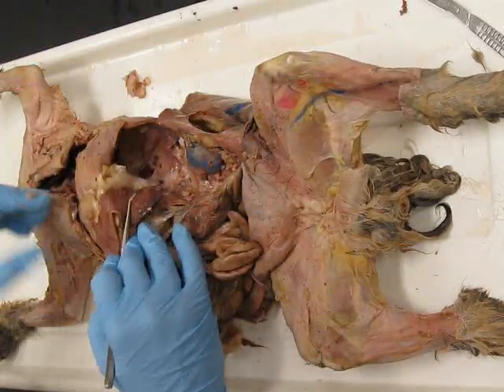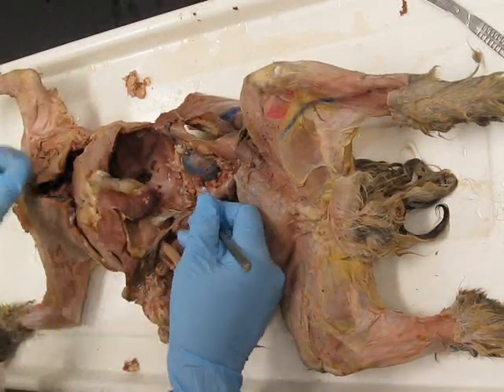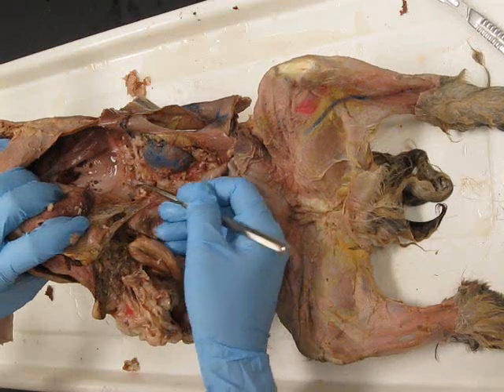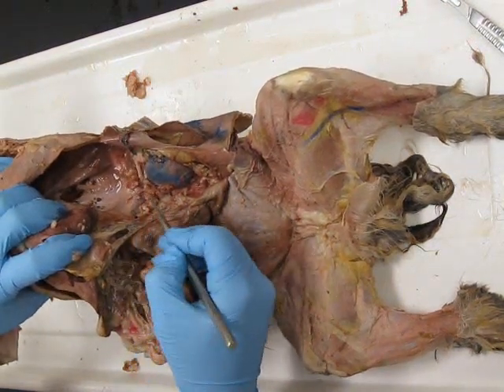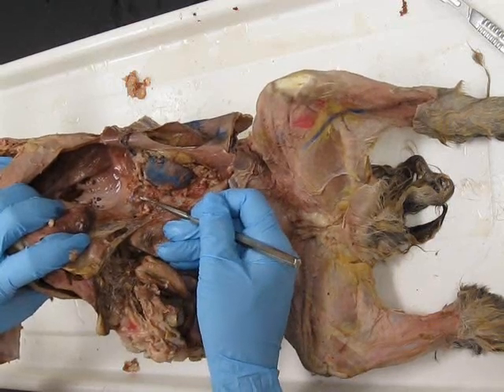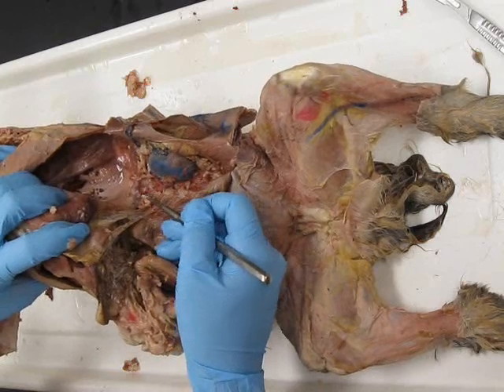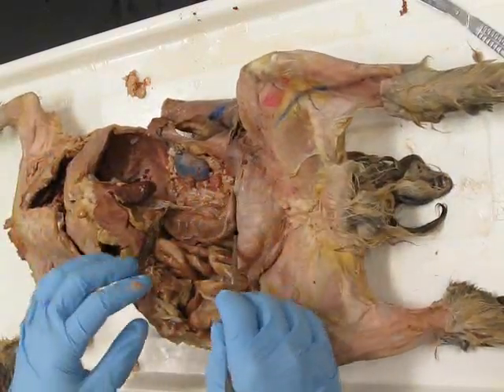Alright, so I'm going to hold this up. And this structure here, above the probe, is the adrenal gland. This looks like a little bean in the cat. Ours is a little more triangular, but still in the same place above the kidney, also called suprarenal gland. Okay, and you're going to do that to the other side.